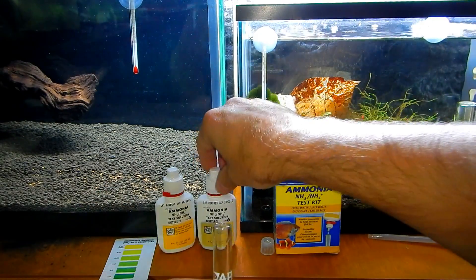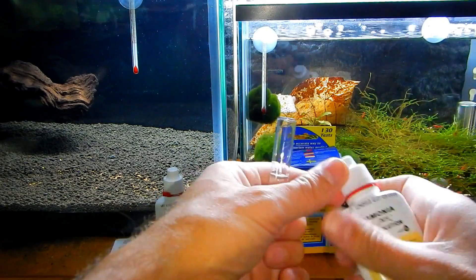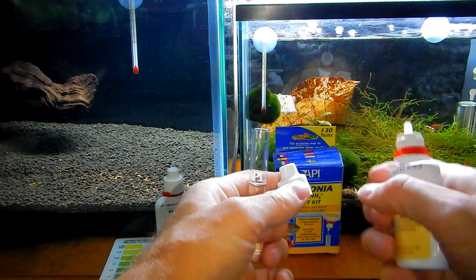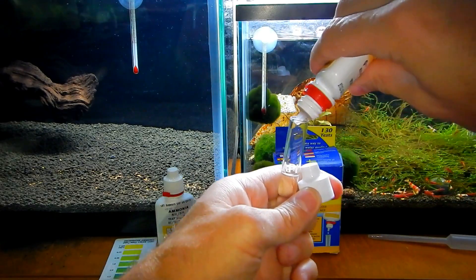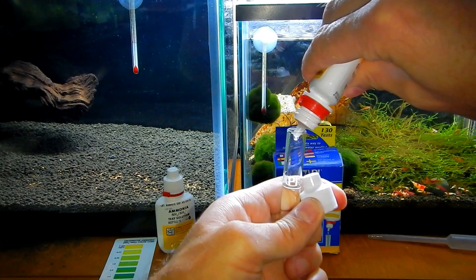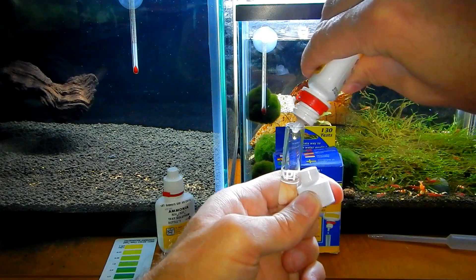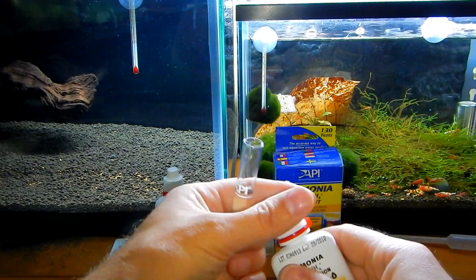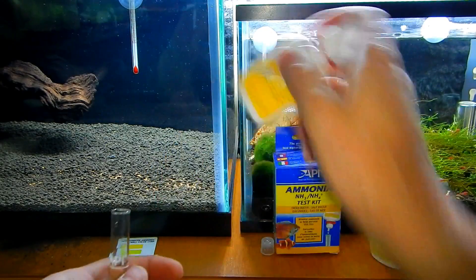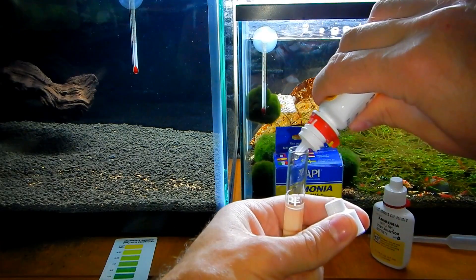The next thing I'm going to do is take bottle number one — there are two bottles in this test kit — and add eight drops. Then I'm going to take bottle number two, give it a little shake, and add eight drops as well.